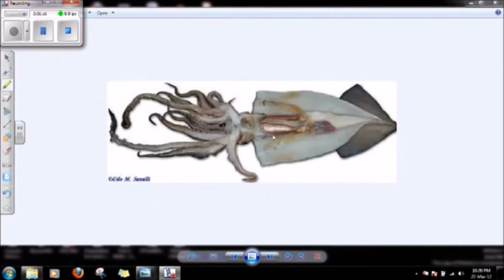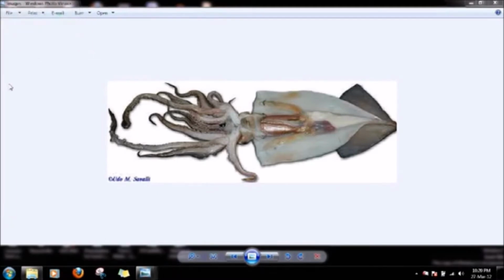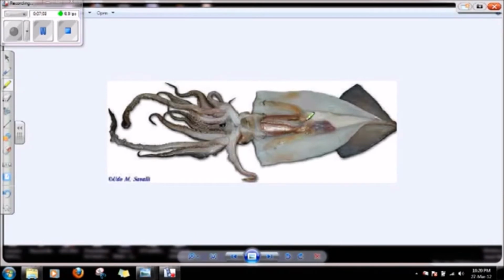Alright, let's take a look at what your squid will look like on the inside now. It might not look quite as clear as this one, or it could be a little clearer. Sometimes it's hard to tell depending on how fresh the squid is. One of the easiest things I'm going to highlight in yellow here for you to see are the gills of the squid. There are two, and they almost look like feathers. They're sticking out from either side.